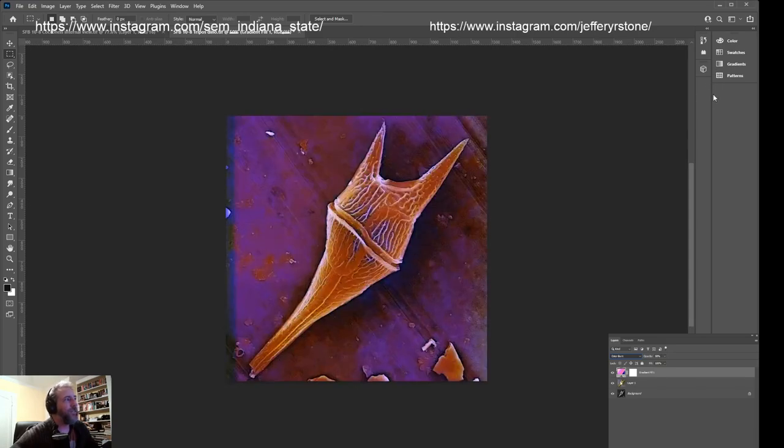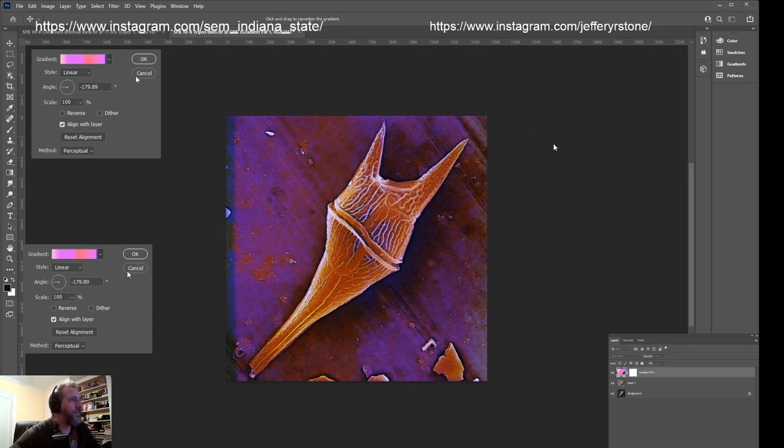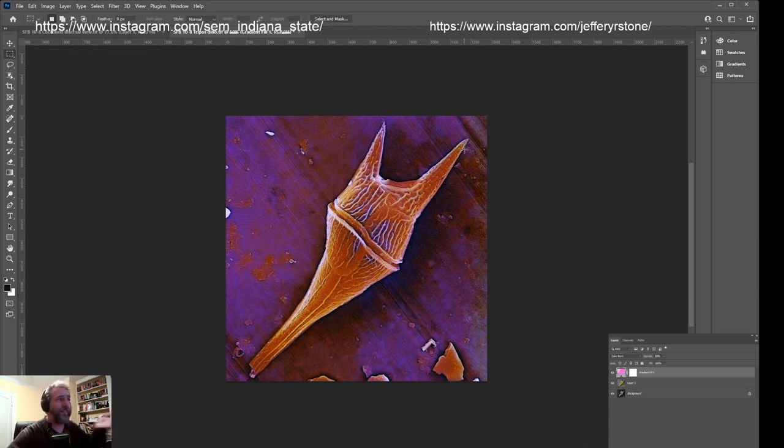All of these things are basically just a filter over the image, and you can use it to highlight different aspects of the image as you see fit. You can build it to make things look across a range of patterns, however you think is best. And actually, this pattern that we have, while I'm sitting here, I don't really like the blue. I noticed there's a big blotch of blue over there. The rest of it, I kind of like the way it is.